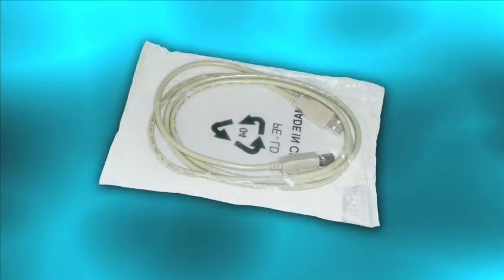The USB cable will connect your new Spectrometer to your computer. But don't connect your Spectrometer just yet — you'll need to install the SpectraSuite software before you do.